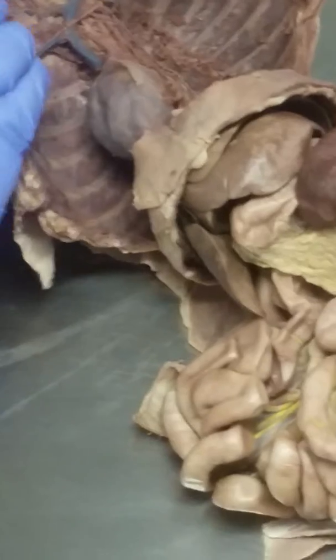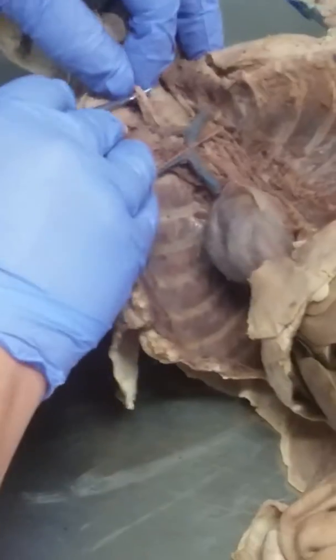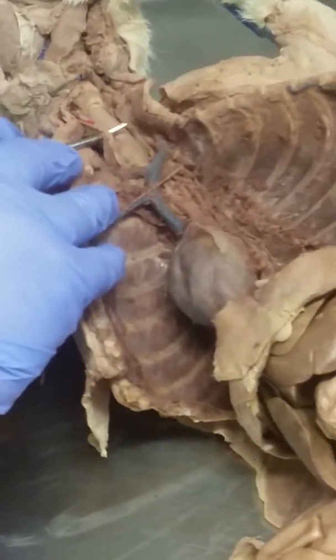And I could trace the right common carotid artery over here. See this vessel? See, here's the right common carotid artery.